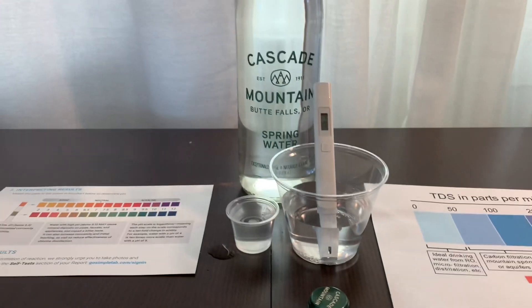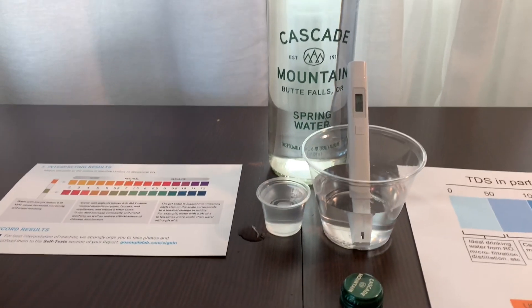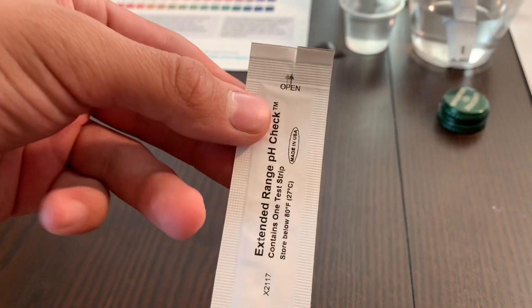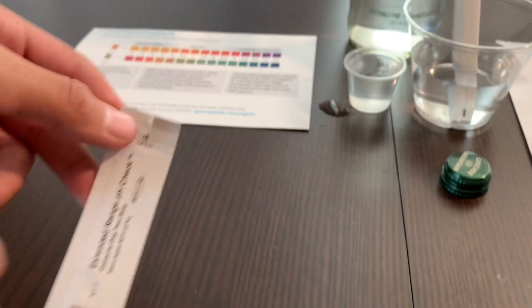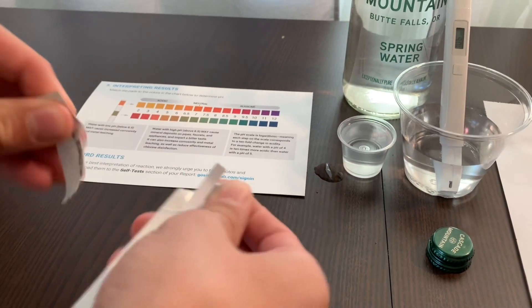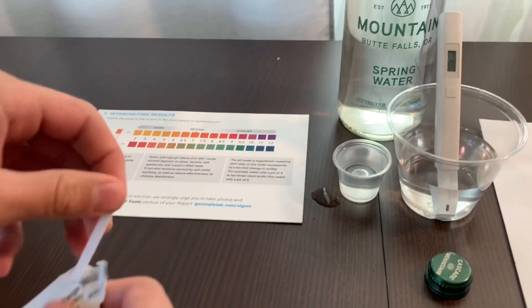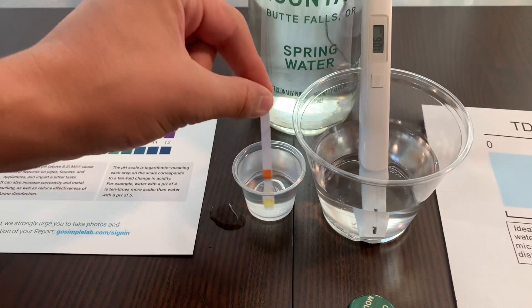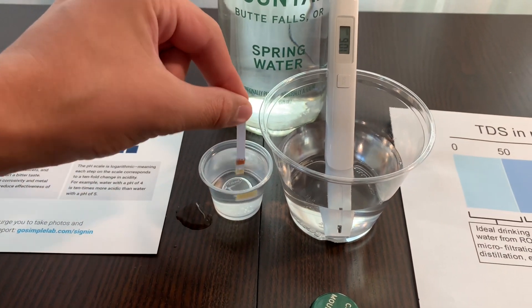Now let's test the pH level. For the pH, we're going to use simple pH test strips. The instructions say to first open the packaging, then take out the strip and put it in the water for 10 seconds using a gentle back and forth motion.